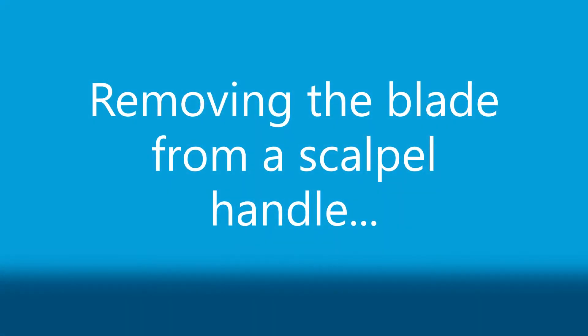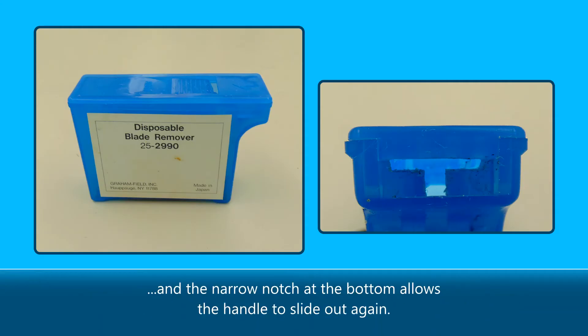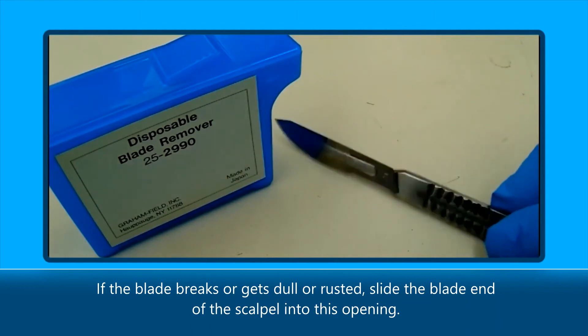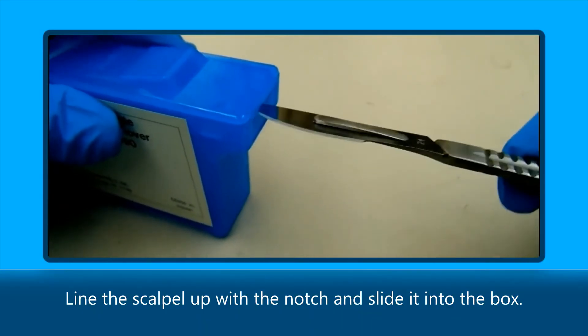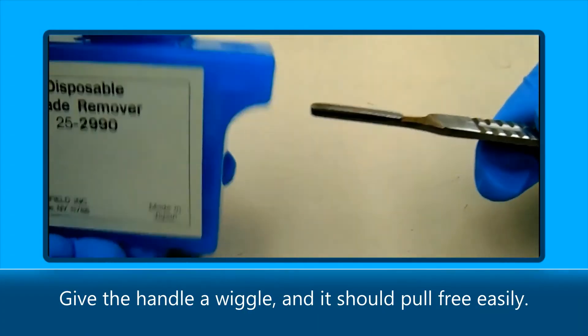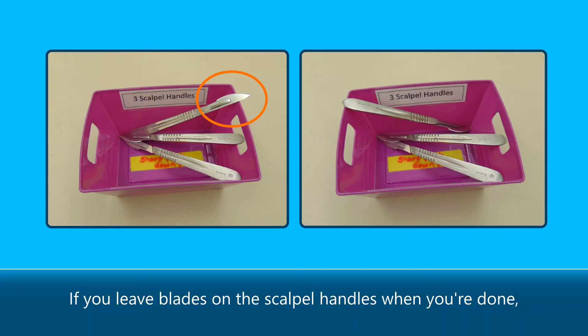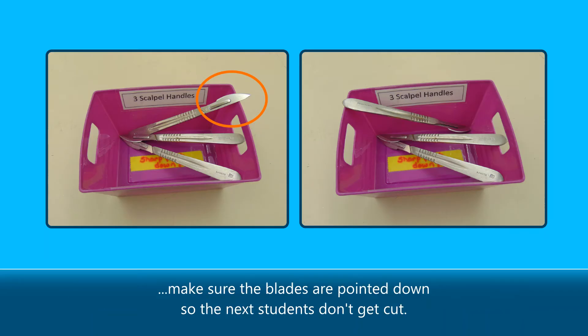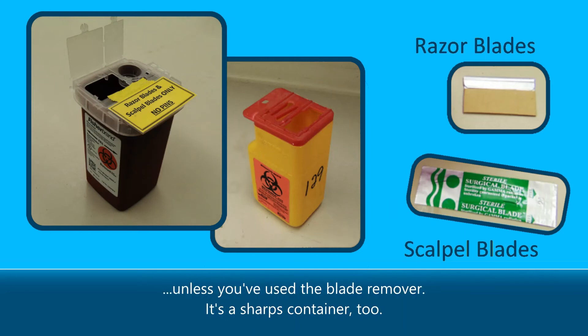Removing the blade from a scalpel handle: this box is the blade remover. The wide part of the opening allows the blade to slide in and the narrow notch at the bottom allows the handle to slide out again. If the blade breaks or gets dull or rusted, slide the blade end of the scalpel into this opening. Line the scalpel up with the notch and slide it into the box. Squeeze down on the top of the box to hold the blade in place. Give the handle a wiggle and it should pull free easily. If you leave blades on the scalpel handles when you're done, make sure the blades are pointed down so the next students don't get cut.